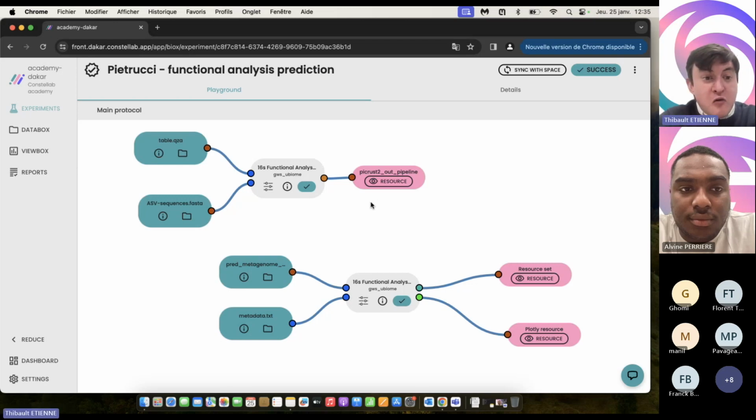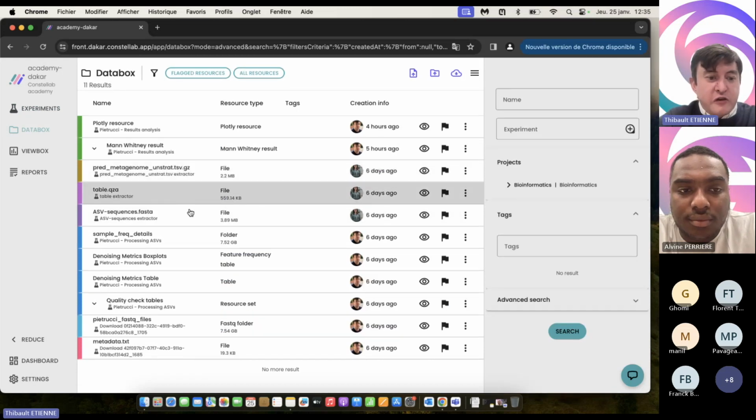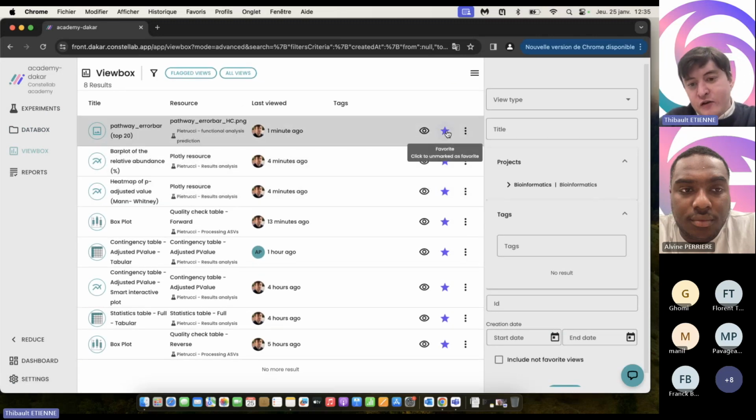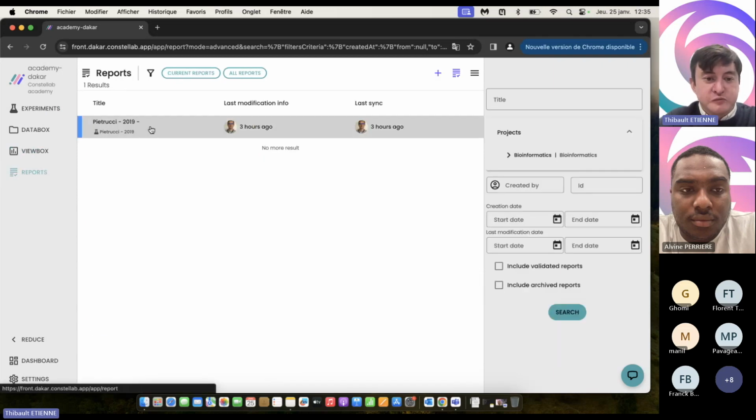Well, now we have all the experiments. All the results are stored in the data box. We can retrieve all the results here, retrieve all the views here, all the tagged views here, and we can create a report.